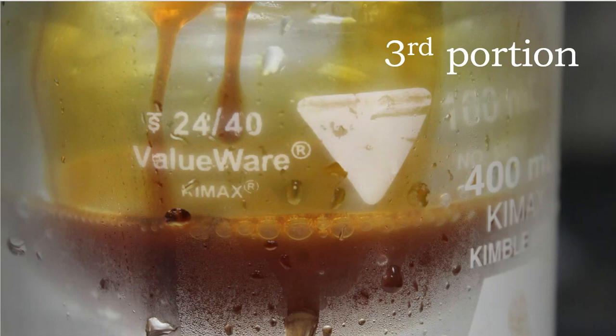I'm adding about 2 milliliters at a time, 1.5 to 2 mL. So 20 to 40 drops somewhere in there. I didn't really keep count because it just really told me portions, and that's just really what I'm doing. So I'm estimating 20 to 40 drops between the additions.